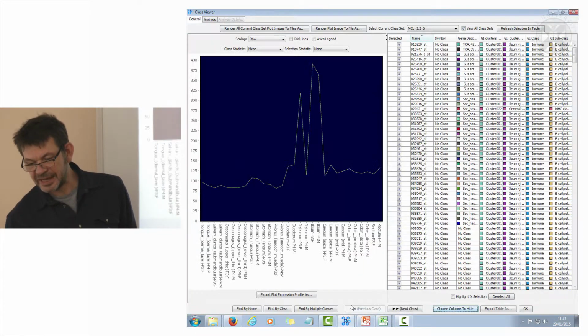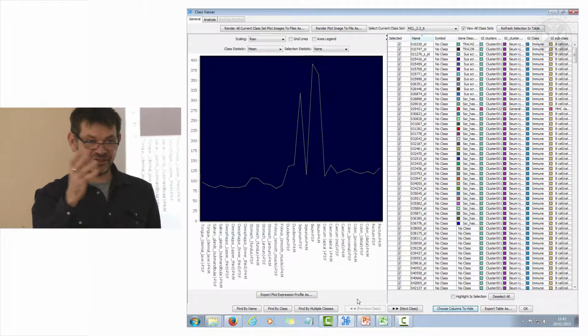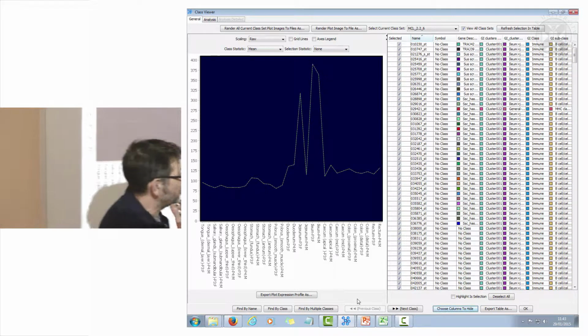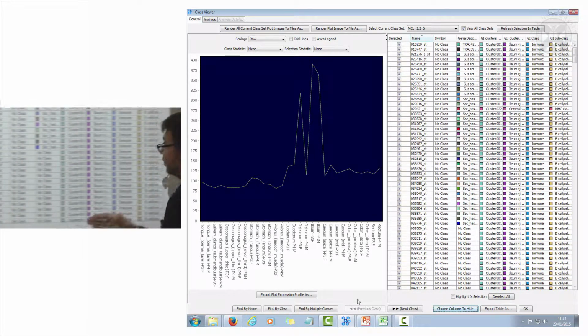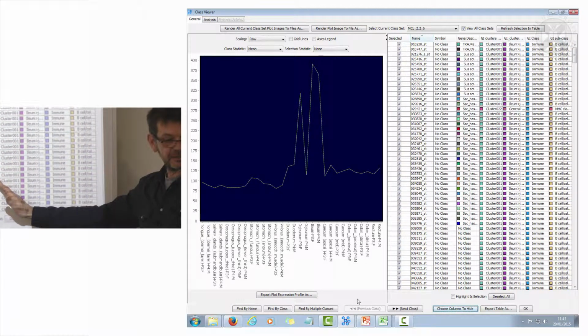So the quick answer to any given data set takes you 20 minutes. Is there structure? Does it make sense? Do I see things that I'm not familiar with? When you get to this level, what I've done with this cluster is I've added annotation to it. So it's cluster 1 of this data set, okay?